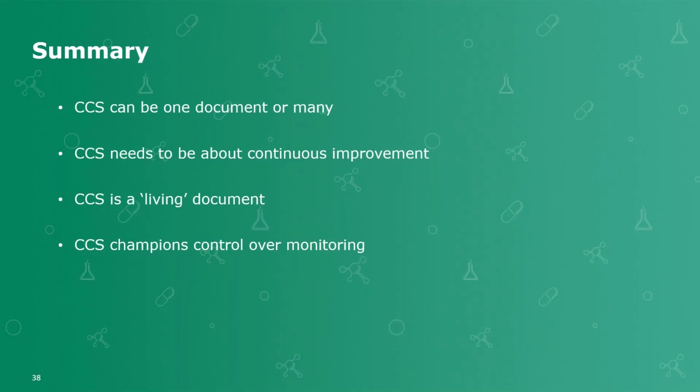Okay, so in summary, contamination is one of the major challenges to the pharmaceutical industry, and we need to have a thorough understanding of sources of contamination and the ways we could control it. So it's unsurprising that Annex 1 requires a written strategy, and this is something that is not done as a one-off activity, but needs to be evolving.